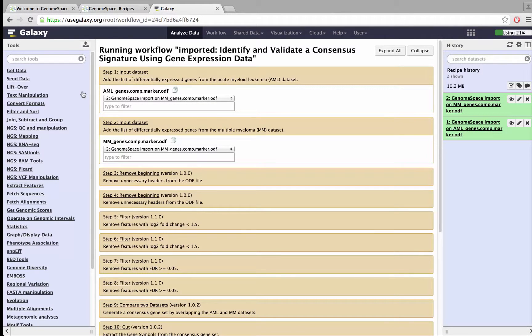Choose input datasets to the workflow from the drop-down menus, just as you would for a Galaxy tool. Notice that our recipe-associated workflows indicate the names of the files needed for each input.